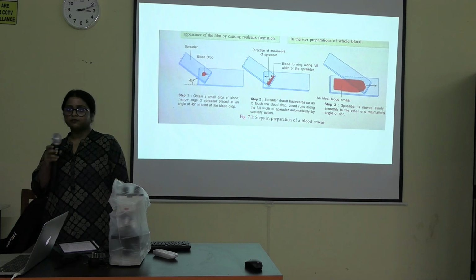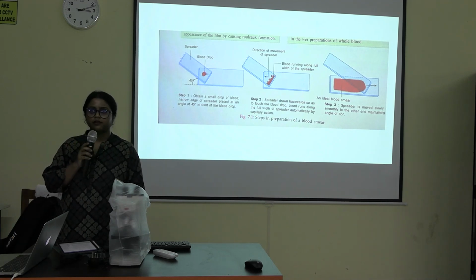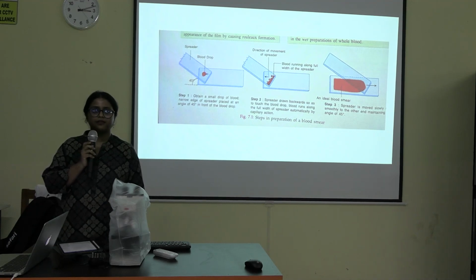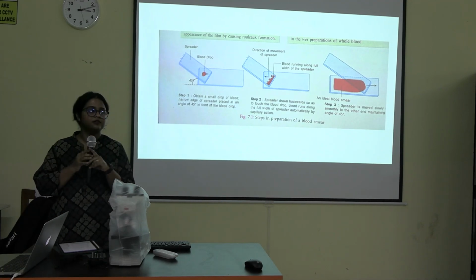So the granules also will vary. Granules of basophils will be stained by methylene blue. Methylene blue is a basic dye and granules of basophils are acidic. So that will stain it.